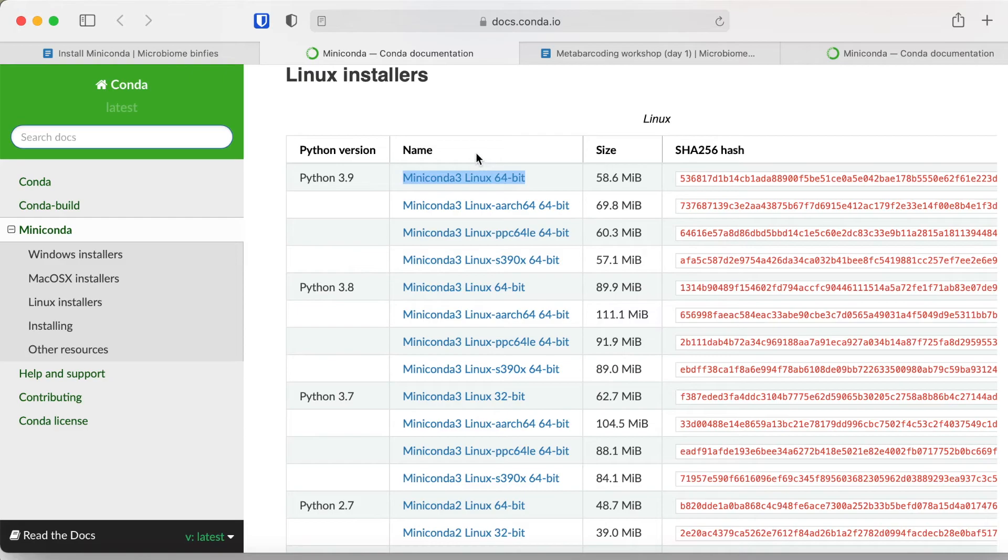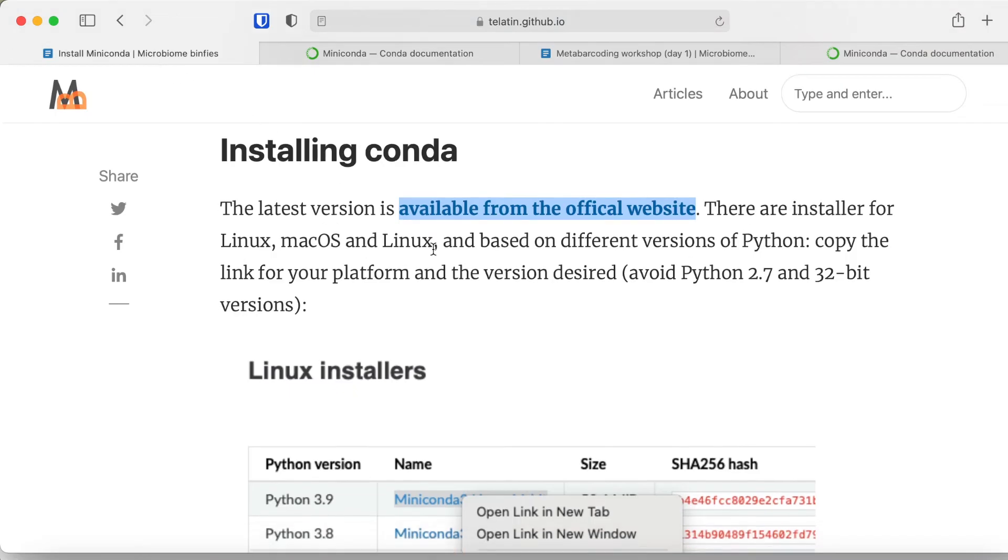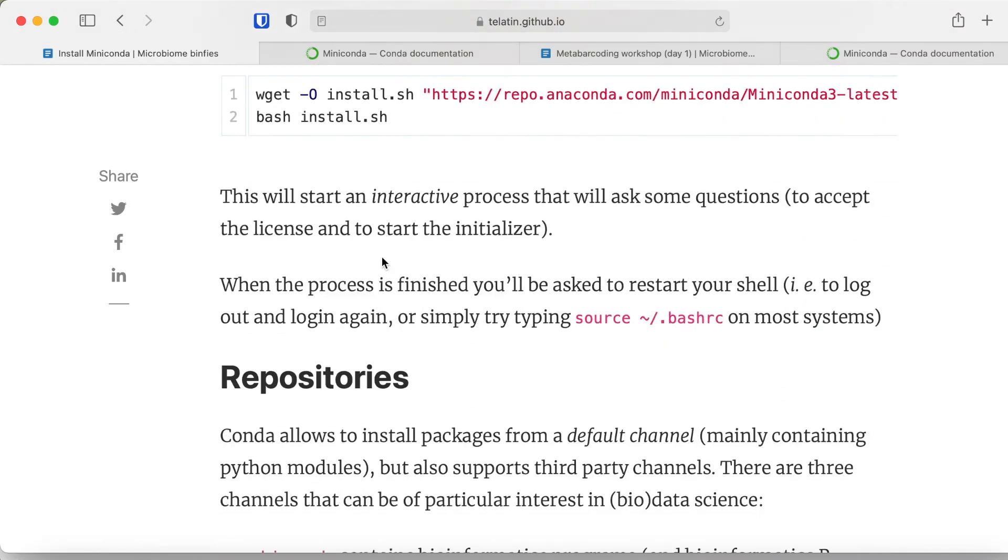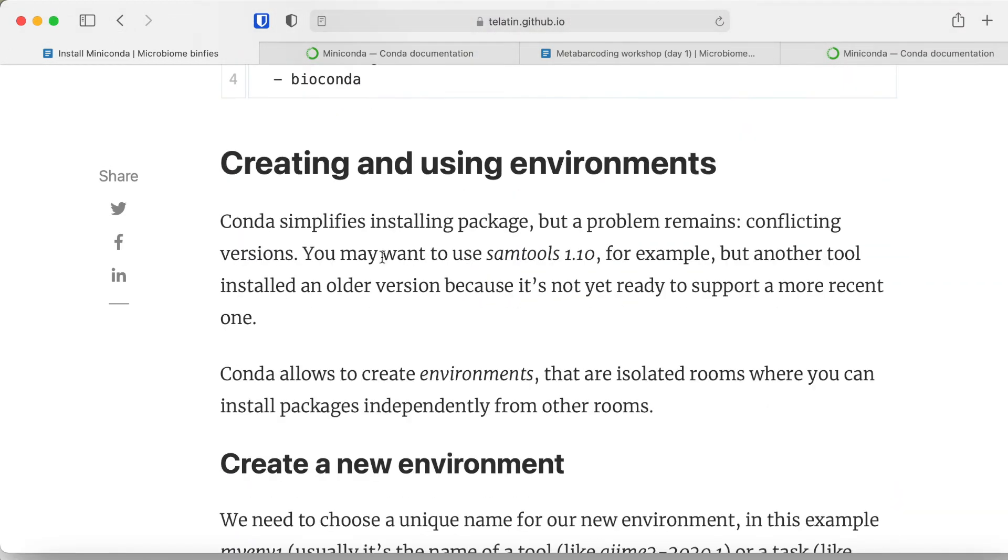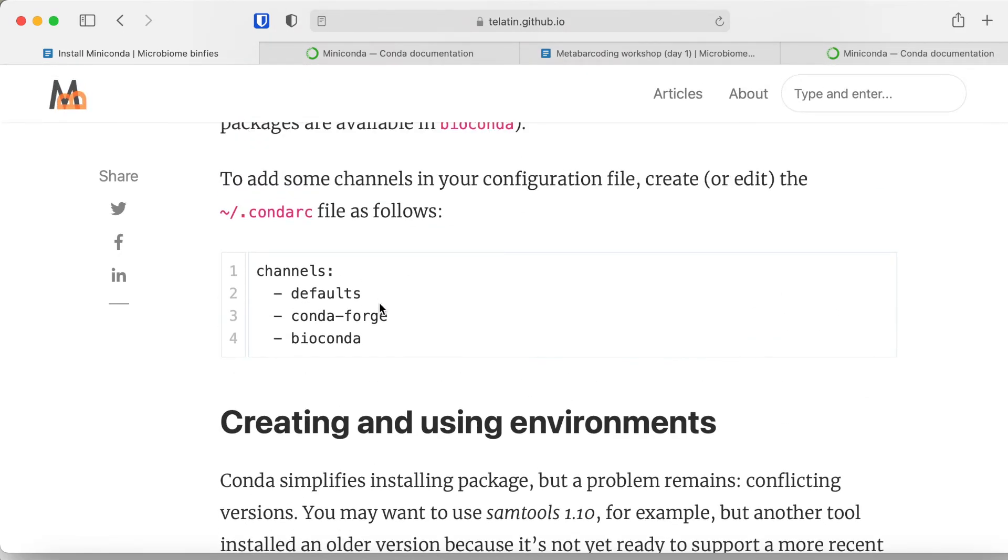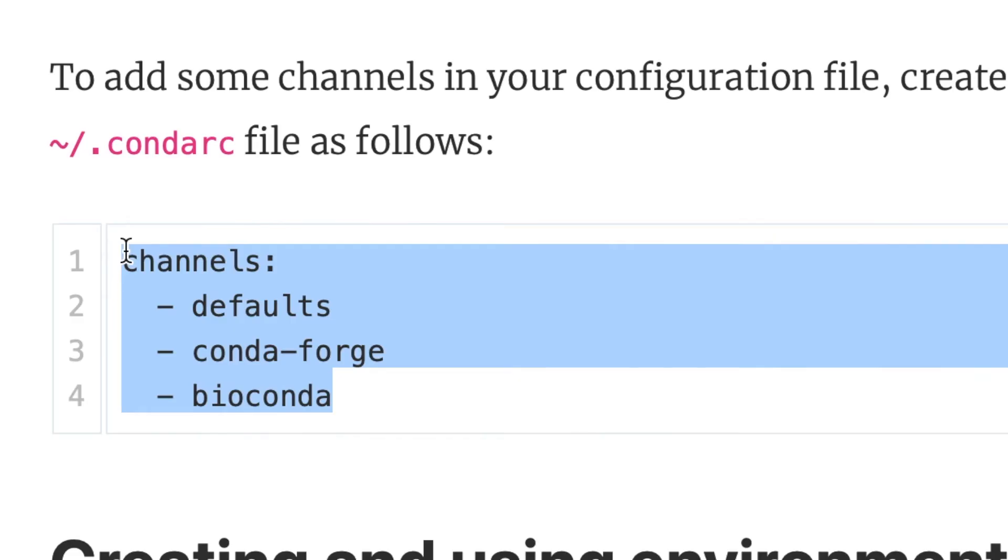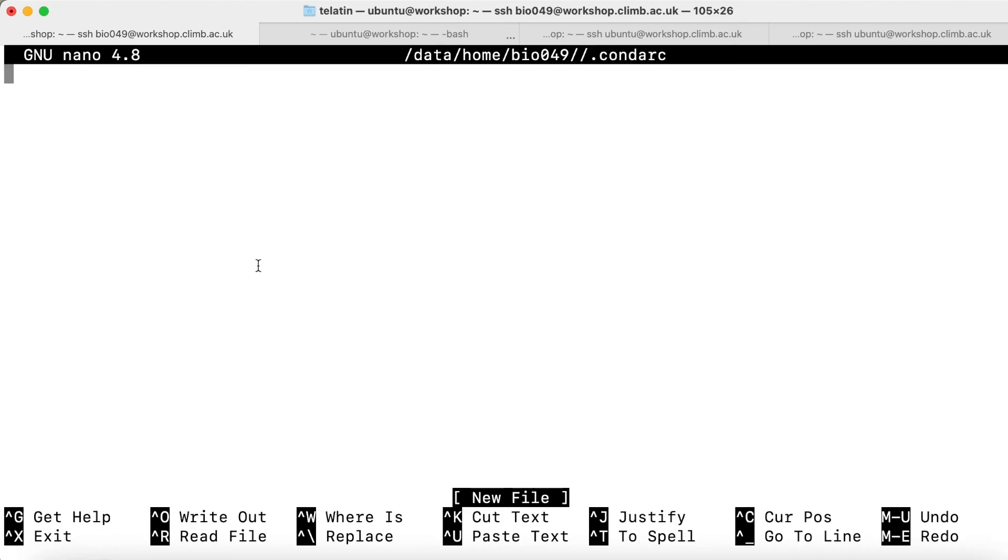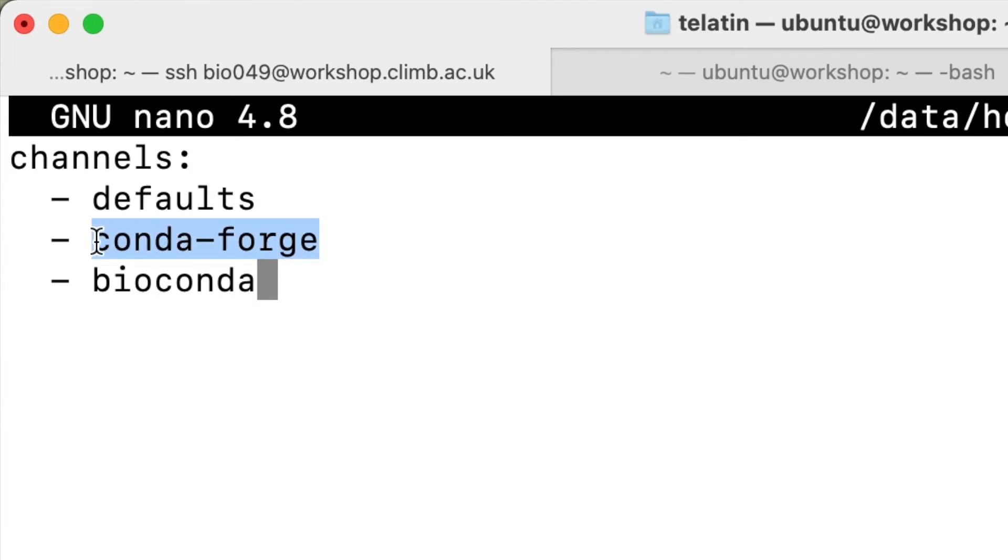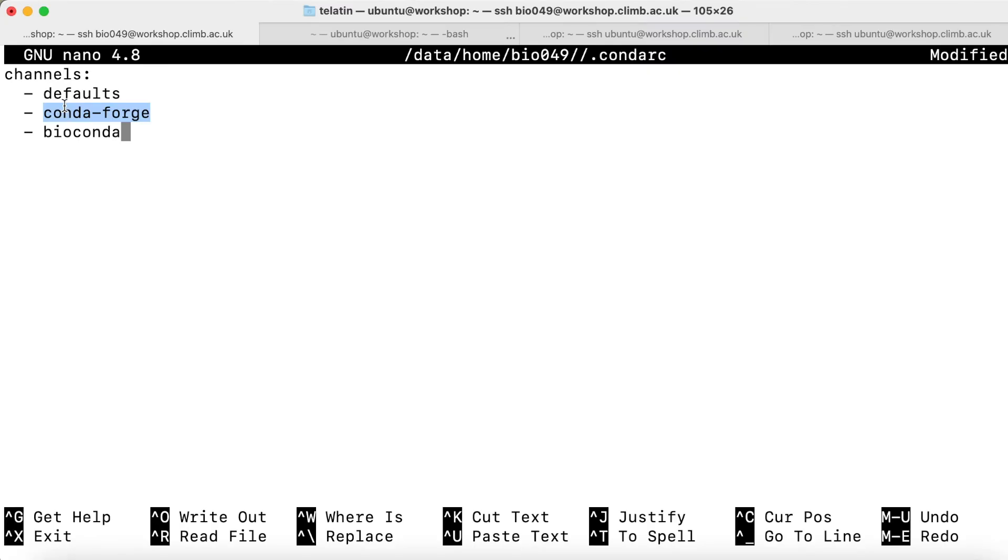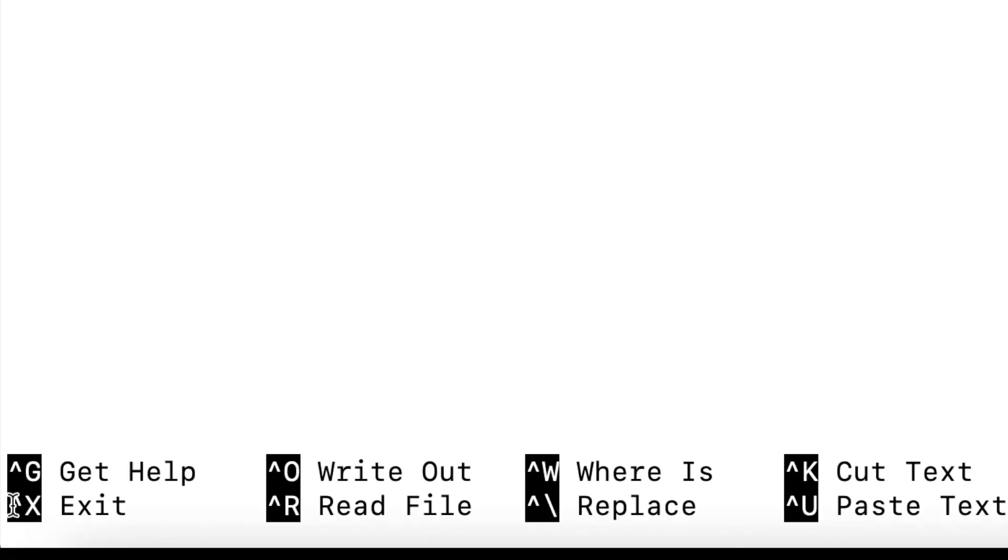In the notes on the website, you will see that there is an example configuration, which is the default channels to use when to look for packages. You should put defaults as the first, and then maybe conda-forge. Sometimes BioConda can also save time, but of course the more channels you have here, the longer it will take to look for packages, so it's up to you. I can be happy with defaults and conda-forge alone. Remember that these are spaces and not tabs. When I'm done, I can control X to exit.